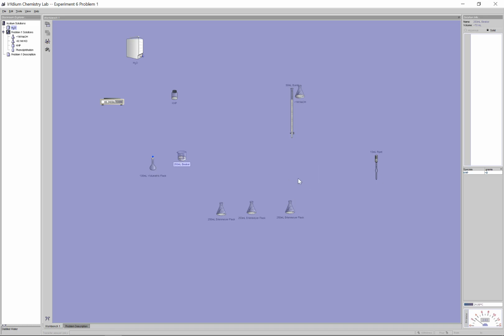So at this point here, we're ready to do a titration. I have my acid in the Erlenmeyer. All these concentrations are the same as my acidic standard, and I have base to actually react against the acid. Only problem is both of these are going to be fully soluble in colorless solutions. I would have no idea whether the reaction is done or not. Let's just go to the side here. Let's pull out our chemical indicator.